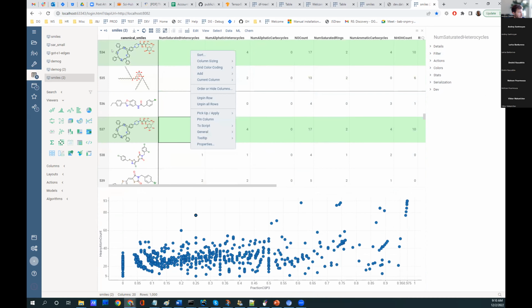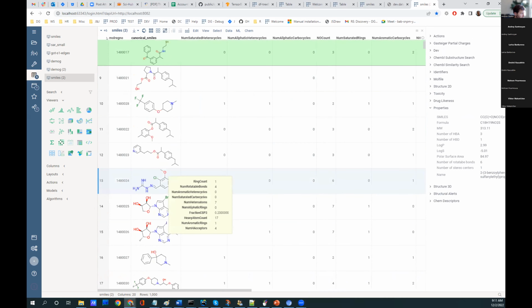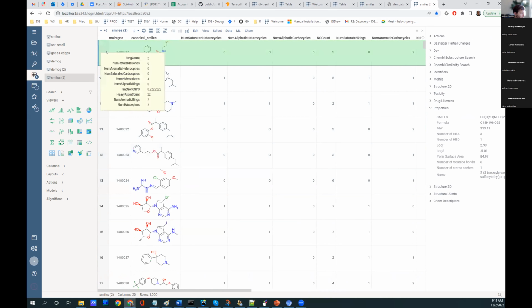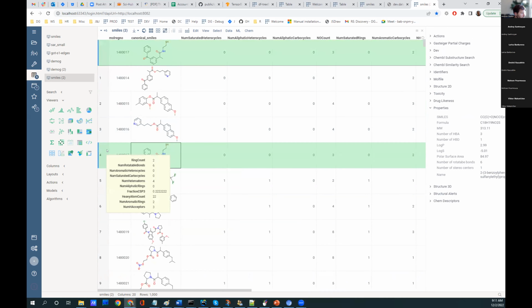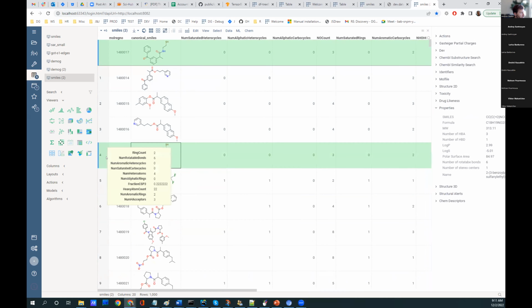It's a little bit misleading, though, that the row index does not stay. If you pin a row and scroll, this particular row does not retain its index, I think. No, it's index 4. It's up here. It's just not shown, right? Yes, because the index has very little meaning. It's just the index of how you do it. So we do not show it.